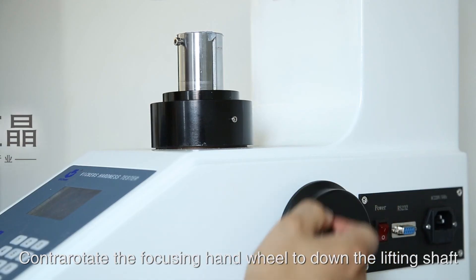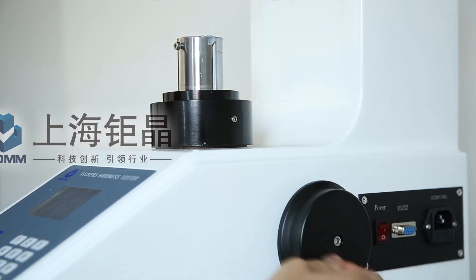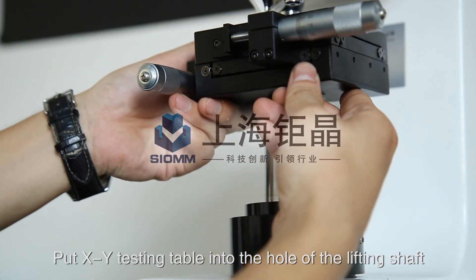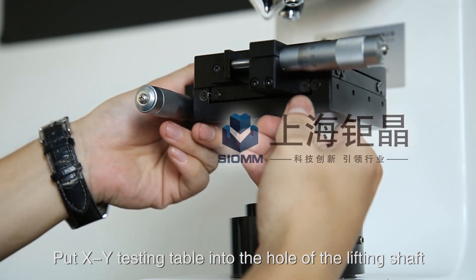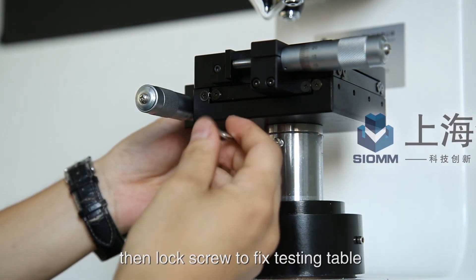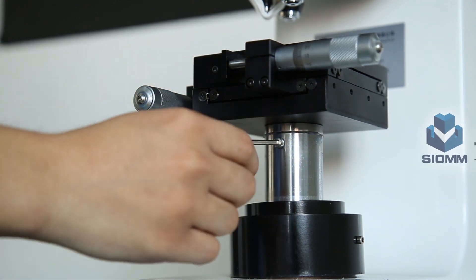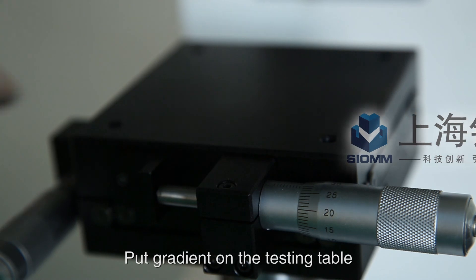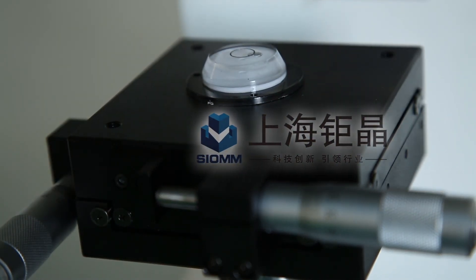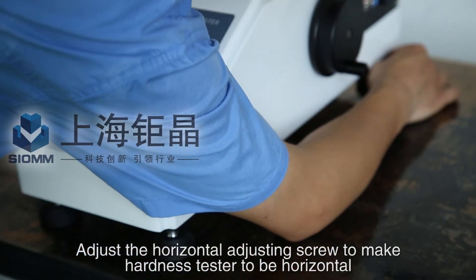Counter-rotate the focusing hand wheel to lower the lifting shaft. Put the XY testing table into the hole of the lifting shaft, then lock the screw to fix the testing table. Place the gradient on the testing table, and adjust the horizontal adjusting screws to make the Hardness Tester level.